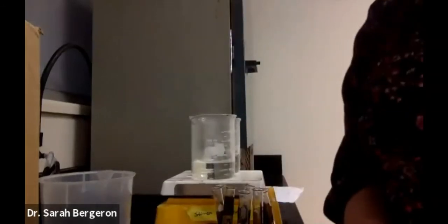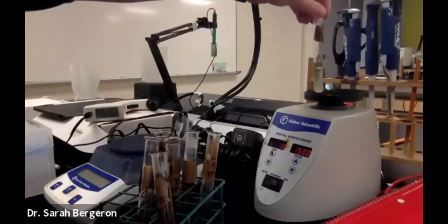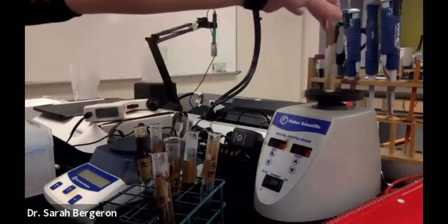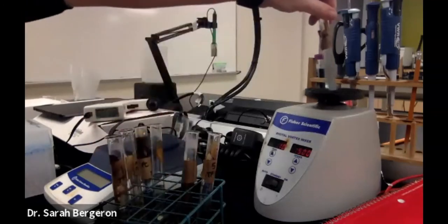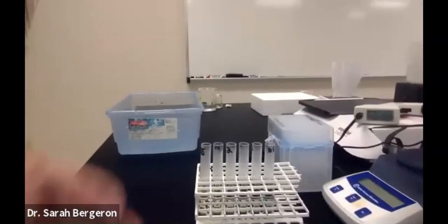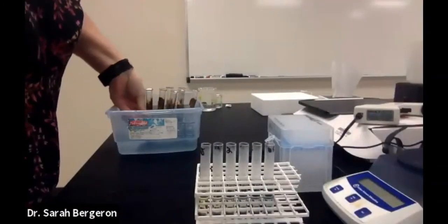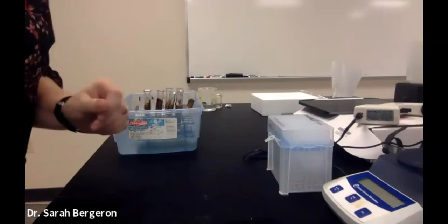Okay, so I'm going to take y'all over. What we want to do is make sure that these are all the way mixed, especially while they're still warm. So just give them a good little mix. And then now we want to put them in a water bath. If you see over here, I have my bucket of water and I'm going to leave them inside of the rack. I'm just going to put that rack in that water to help them cool a little bit faster. So now, 5 minutes.